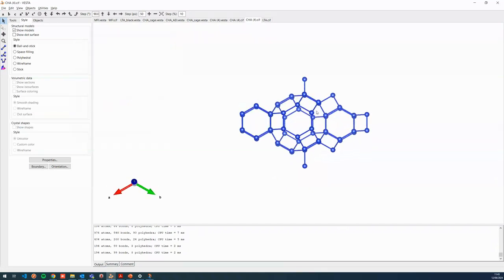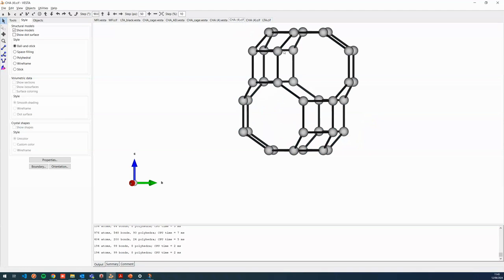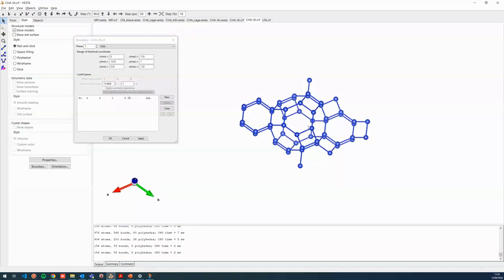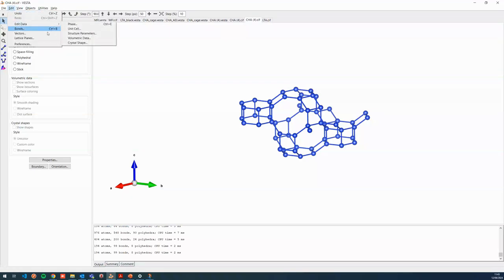But unfortunately, you will see there's still parts over here and over here that you want to remove to really get to this cage. If you compare this to this, you can see we still have to remove some clutter or some parts. You could do it again by selection tool, but again, you will face the same issue. If you ever have to change something, you will have to select, deselect, or re-delete this part again. So let's try to avoid it. And what we can do is further play around with the borders, but sometimes your crystallographical structure will not allow it. As is the case here.